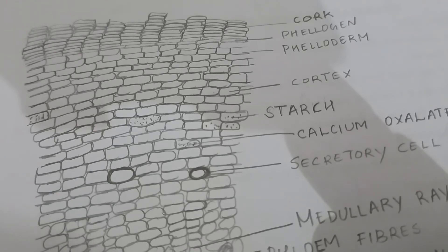After the periderm portion we can find the cortex which consists of several layers of thin-walled tangentially elongated cells containing reddish-brown matter.